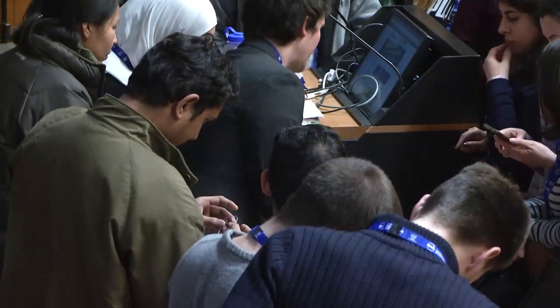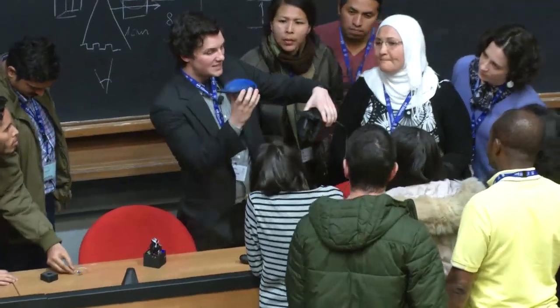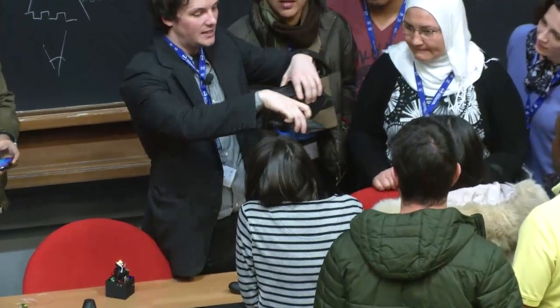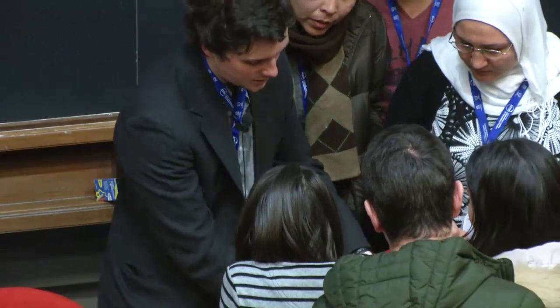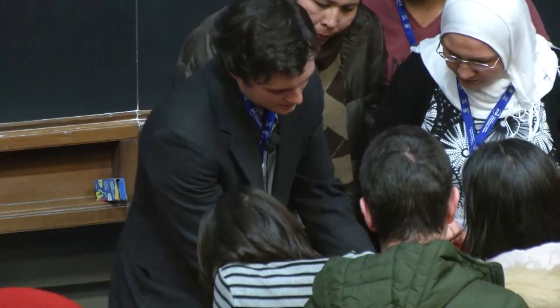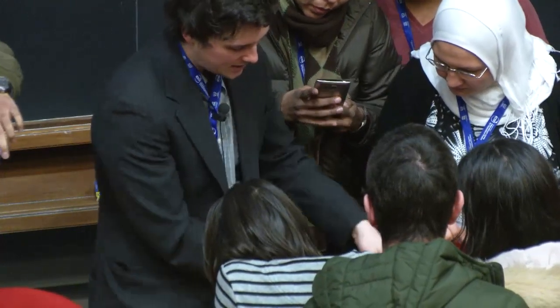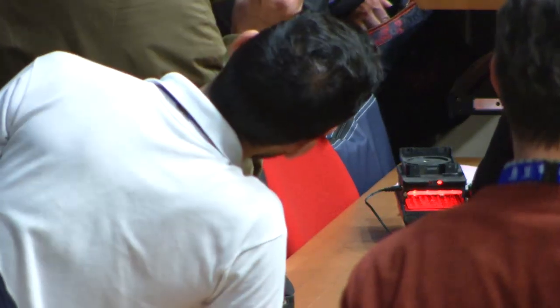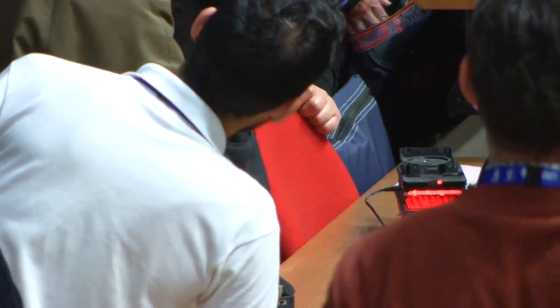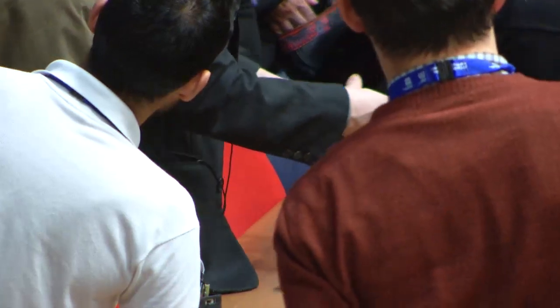So I brought this for demonstration because I can't exactly open this up, but this is contained inside here. So these here are coupled to the ELISA wells in here. So this sits on top of this, and this is in here. And then this is what you're seeing in the image. You're seeing the red light coming out of all these optical fibers. And we built the system for fluorescent ELISA well assays as well.